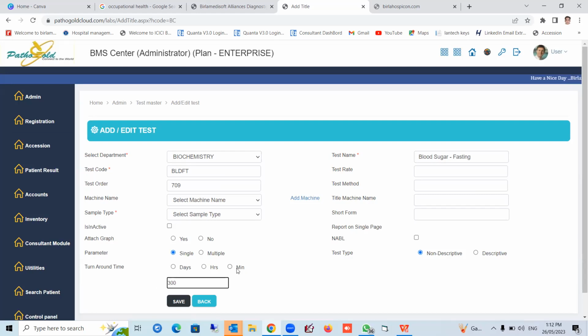Okay, so you have to make sure you click it before saving. You see everything is correct, and then you save it. Otherwise, sometimes this will not be there and it will just save it, and some other test parameter will be completed. So before saving, you select that everything is correct.